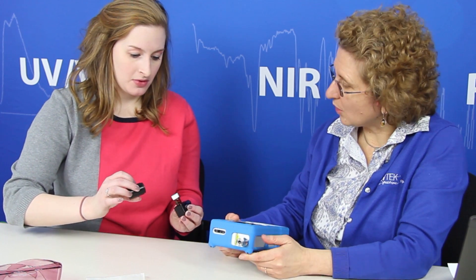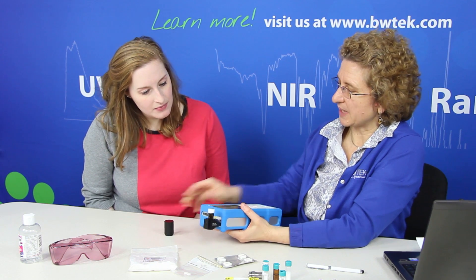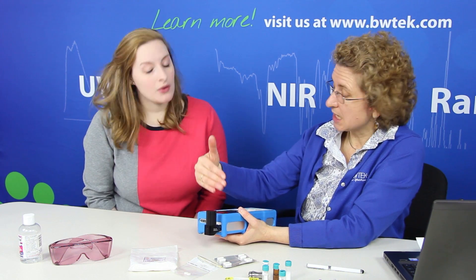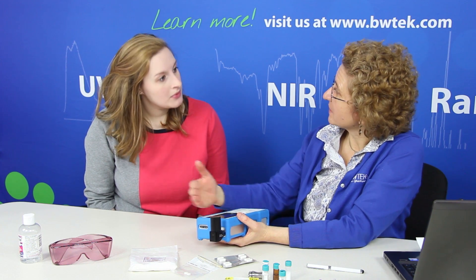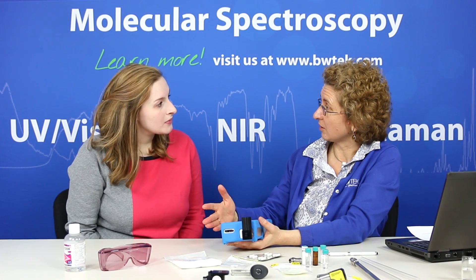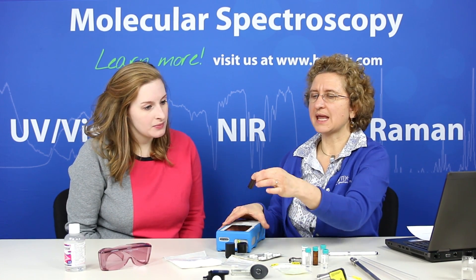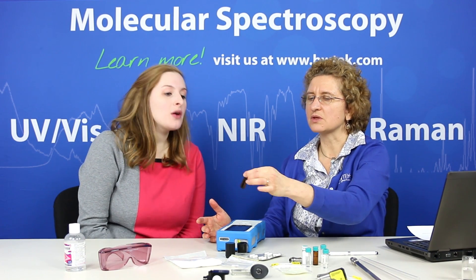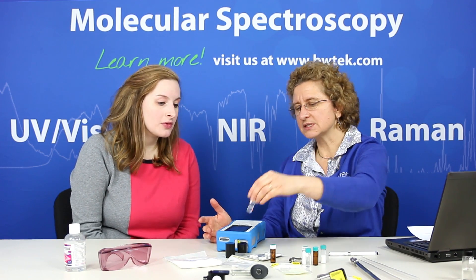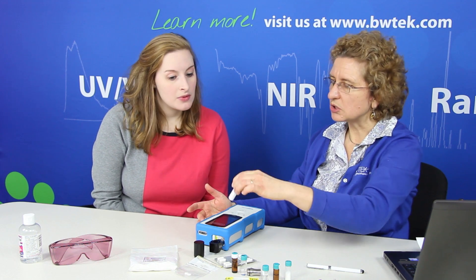So that seems pretty versatile. What about some of these other accessories, like this one? That is a vial holder, and here we have an amber vial which contains ethanol. We can easily interchange between adapters, put this one in place, put the cover on to keep stray ambient light out, and then run this against the method — or if it's a complete unknown, use our investigation mode to search all our libraries and see what it matches with. This allows us to measure using standard disposable laboratory glass vials. This is the amber one and this is a clear one, and while we call it our liquid vial holder, you could use it for solids as well.